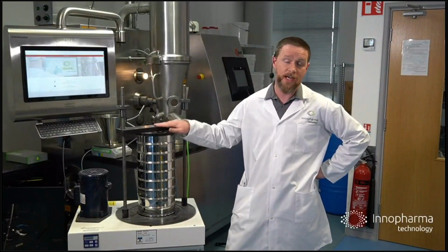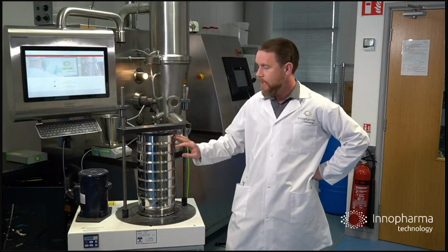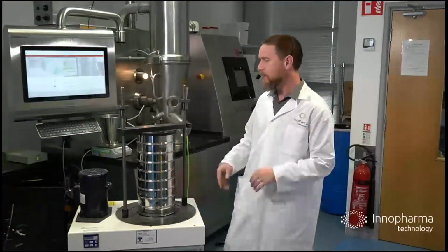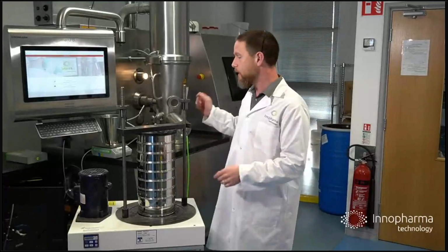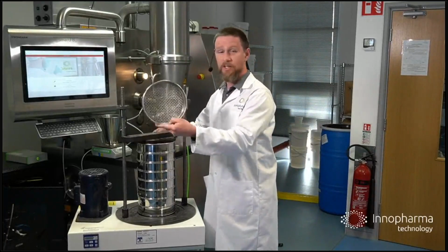So you put your material in the top, maybe 100-gram sample. This will shake for a set time, depending on the SOP that you set out. And then you weigh all the sieves before and after to find out how much weight is sitting on each one of these stacks. From there, you'll be able to build a cumulative distribution curve, and we'll show that a little later on.